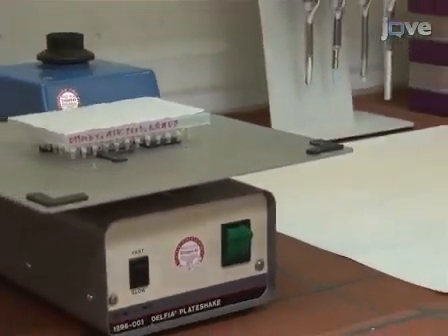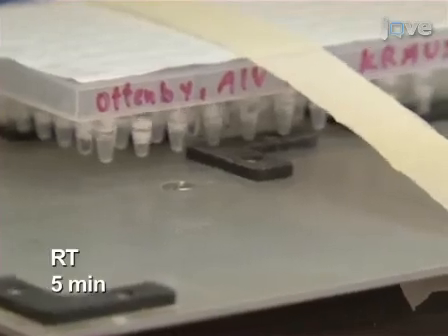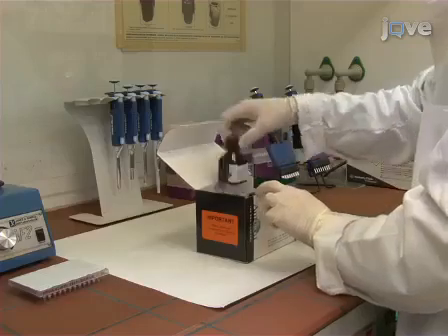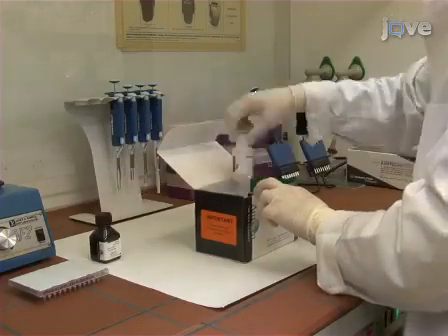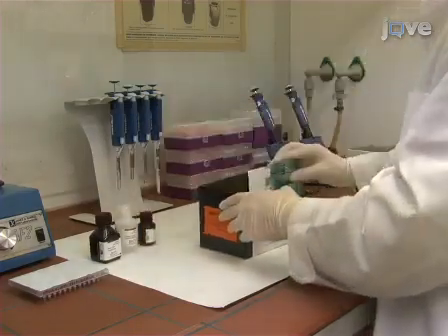Place the plate on a shaker and set the speed, ensuring that it does not cause spillover. Incubate the plate, shaking at room temperature, for 5 minutes. Following the incubation, use Ambion's MagMax 96 kit to isolate the viral RNA.